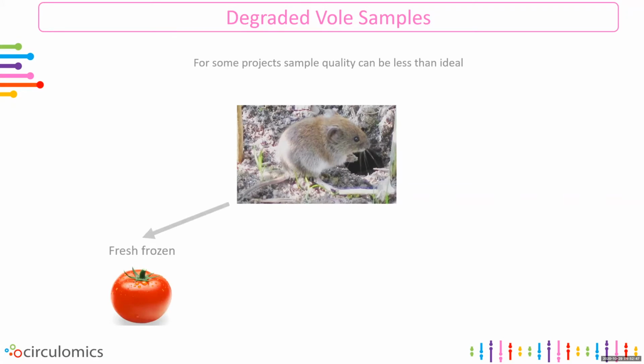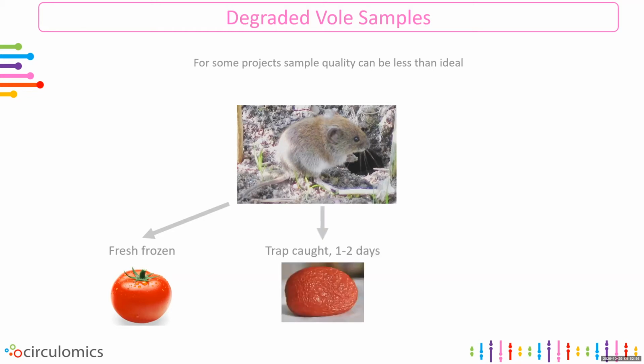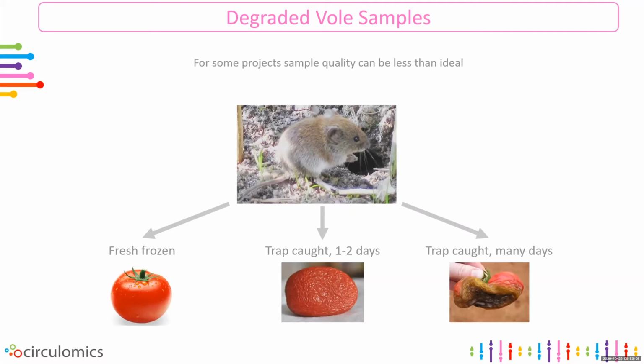But some of the other individuals they were looking to sequence, which is often the case with non-model organisms, were caught in the wild. So they had one individual that had been caught in a trap, and that individual had likely been there for maybe a day or two. So it was a little less fresh than the fresh frozen sample. And then there was another individual that had been in the trap, obviously, quite a few days. So in this case, when you're looking at these non-model organisms, you often don't have the flexibility to choose. What you get is what you get. So you kind of have to make the best of what you have.